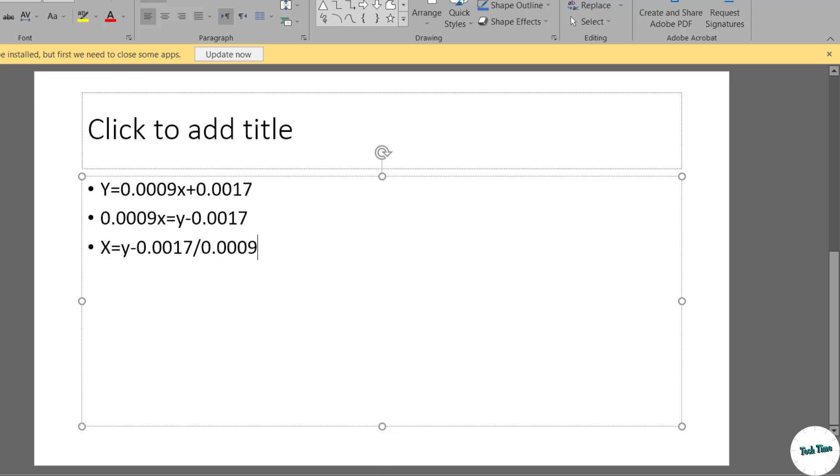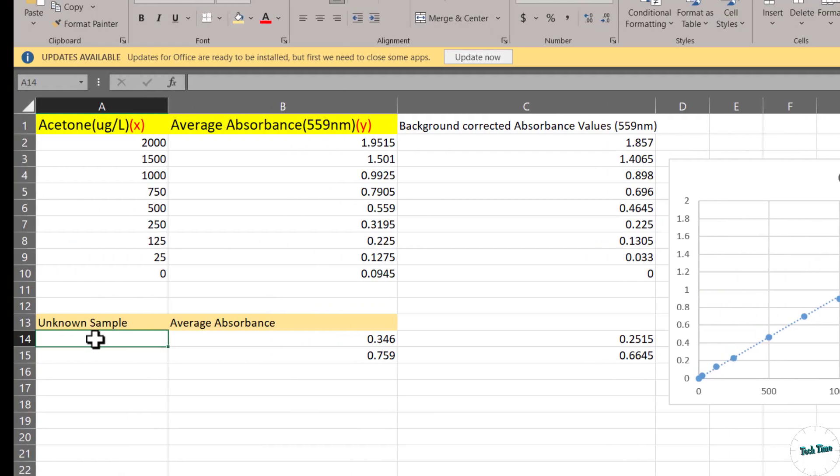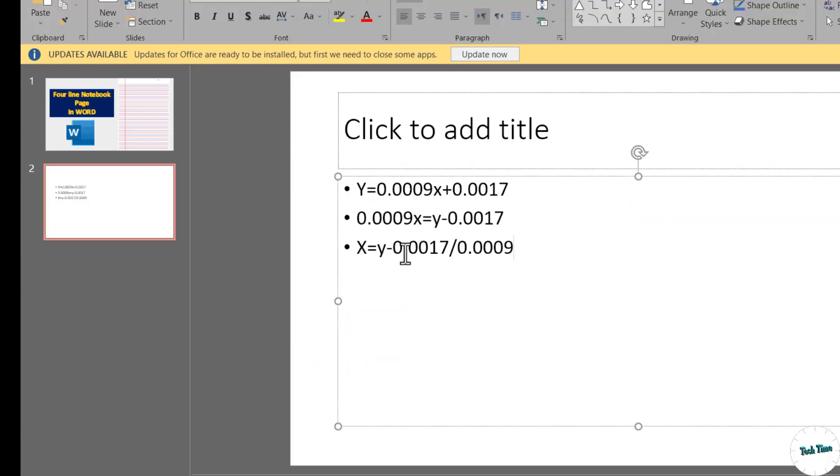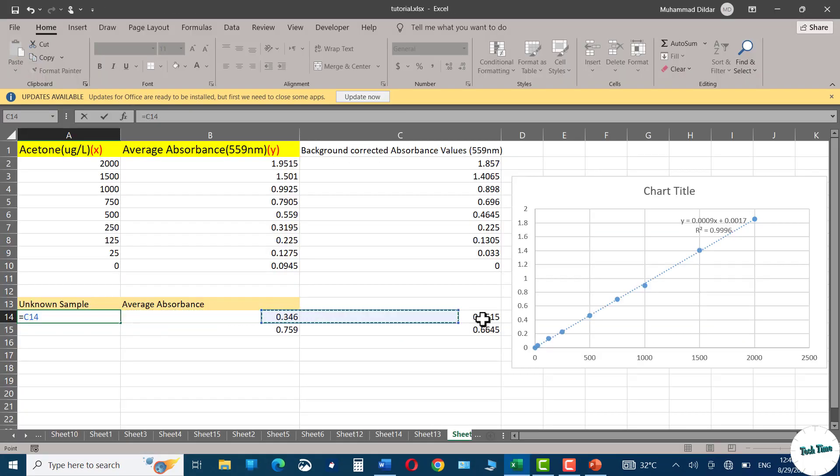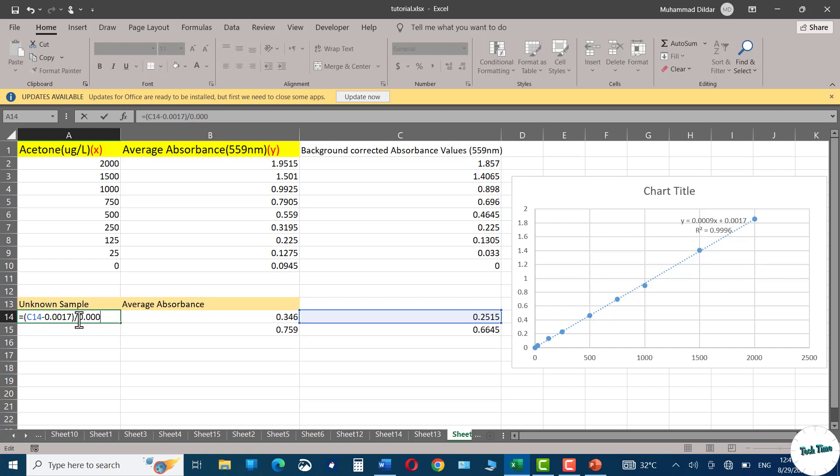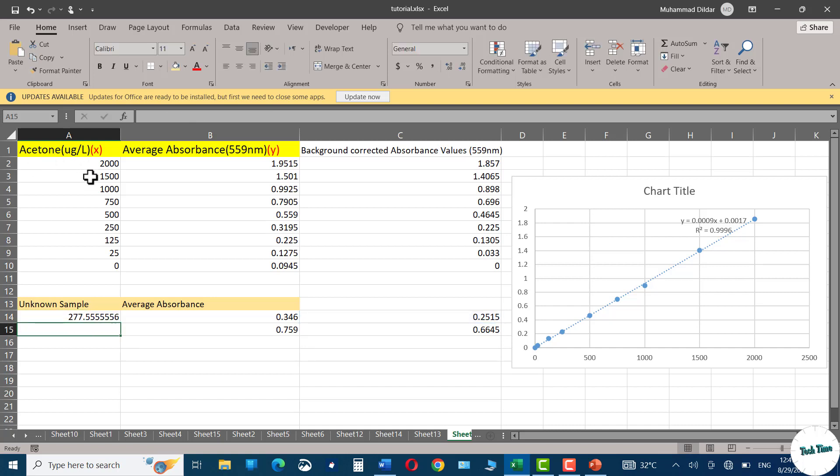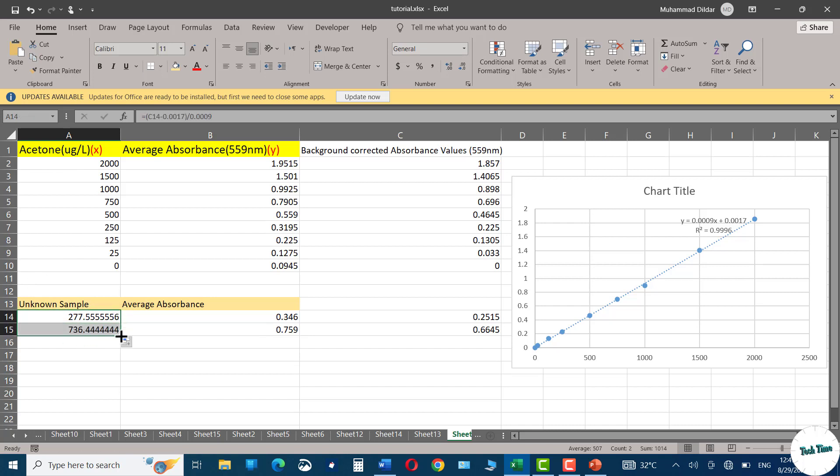Let's do this in our Excel sheet. We will put equals y minus 0.0017. This is y minus 0.0017. Let's use the brackets to enclose it, divided by 0.0009. Press enter and there we have the amount of acetone in our unknown sample. Simply drag it and there we can have it for the other sample as well.